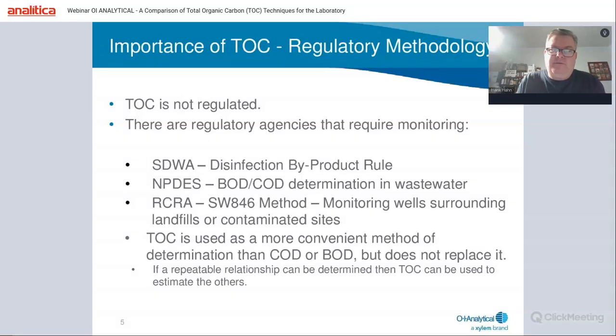TOC is not regulated, though. There are methods here that describe it, but it's not a mandatory regulation. There's EPA methods. There's ASTM methods. There's ISO methods for this. There are regulatory agencies, and this would stand here in the United States.